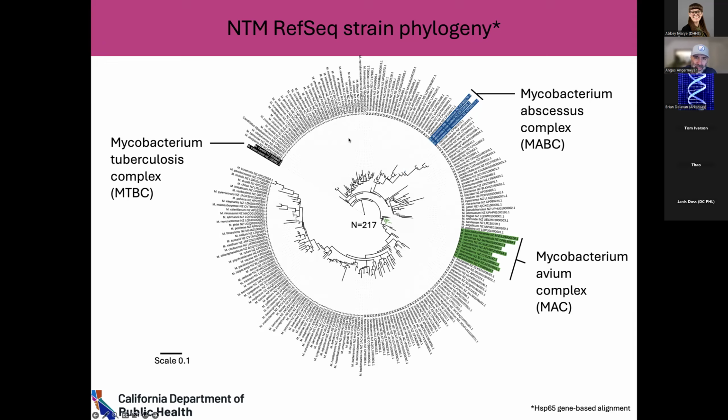There's 3 main species, and they're shown here: abscessus, or subspecies, excuse me, abscessus, bolletii, and massiliense. And those are very, very related. And so one of the issues with this pipeline is that it's been difficult to not only analyze a number of species that are highly diverse across the range of NTMs, but to also correctly identify specific species within these much more closely related groups where the clinical treatments may actually differ.